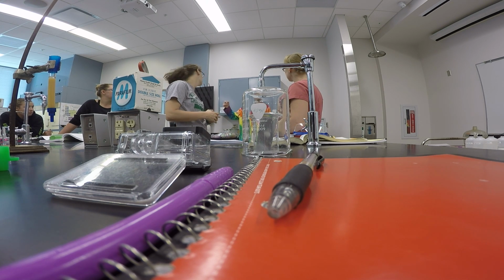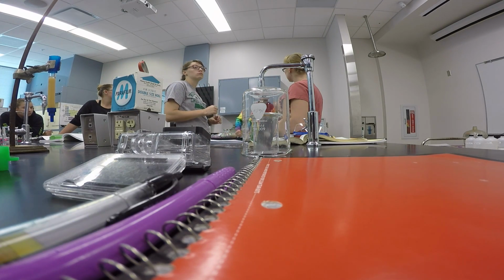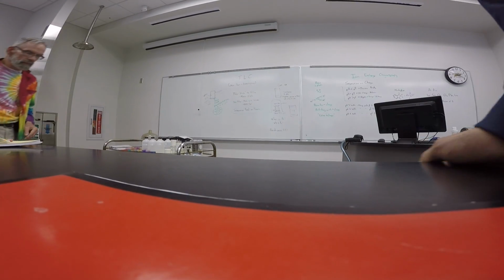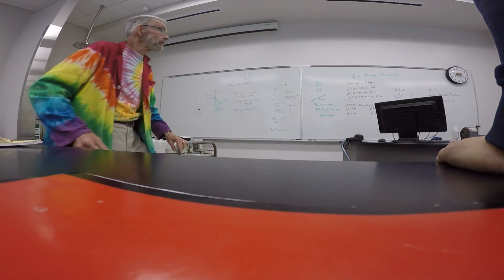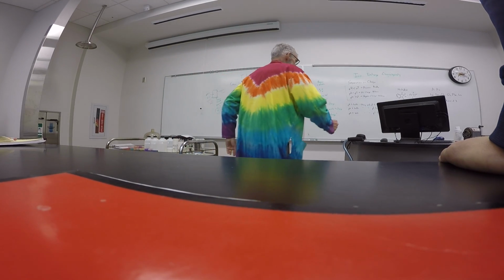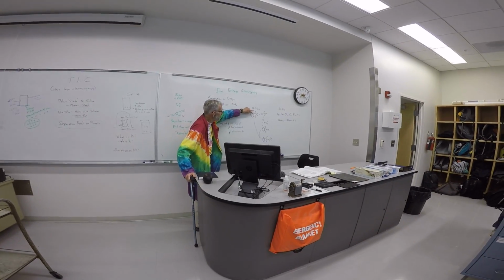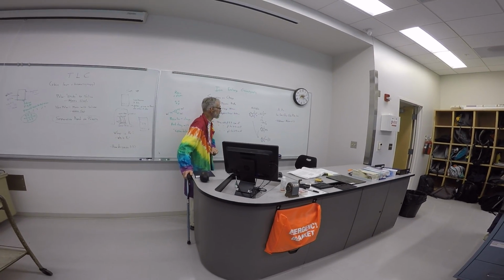We don't have any fluorescent material, so this is where we have to use chemistry. The chemistry we're going to be using is ninhydrin. It's this handy-dandy little guy: a little aromatic ring connected to a 5-member ring. The 5-member ring has a couple of carbonyls and a couple of OHs.